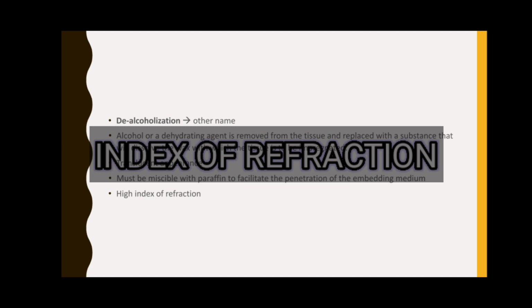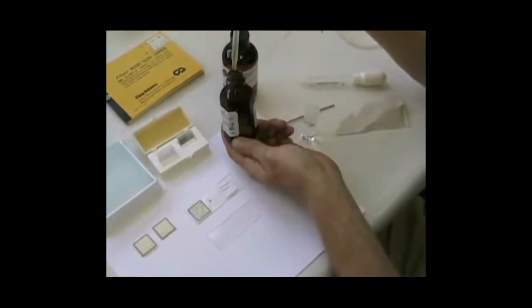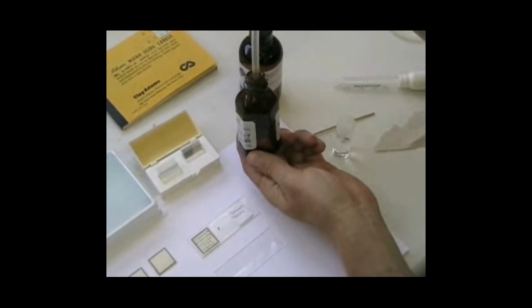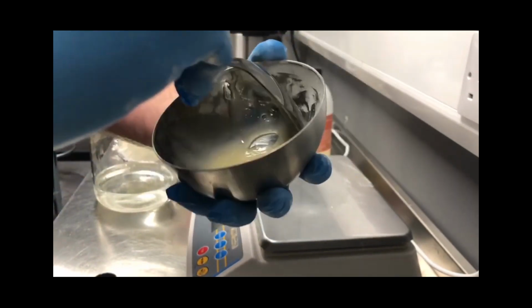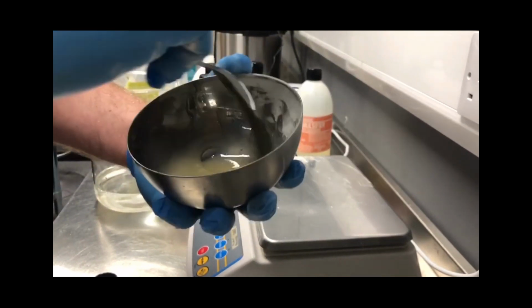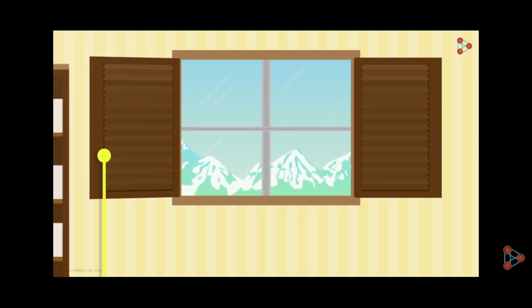another medium. Aside from removing alcohol, a clearing agent must also be miscible with Canada balsam and other resins that are used for mounting the sections. Glycerine and gum syrup are used when the tissue is to be cleared directly from water, like in a frozen section. No de-alcoholization is involved in this process. The clearing agents merely improve the refractive index of the tissue.